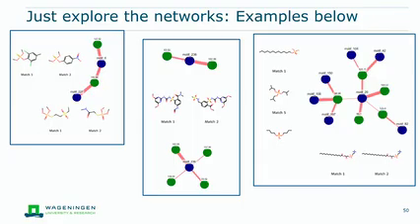And this is, again, for exploring your data set. You don't know what you're looking at, what is linked together, and also some expert knowledge, if you have some, could also be really helpful to extend it. One also important thing I want to mention is, if you're used to using Cytoscape, when running the tool, a GraphML file will be generated, so you can just put it into Cytoscape. And I will mention it later, but in a case study, we also used it together with MolNet Enhancer to have a combined network of Spectra as well.